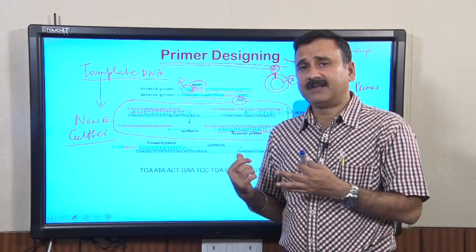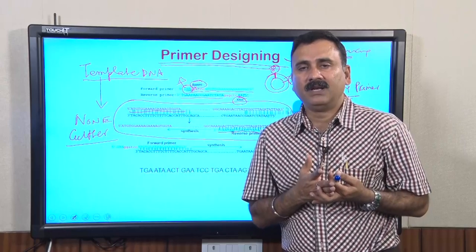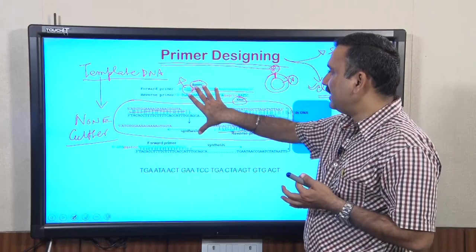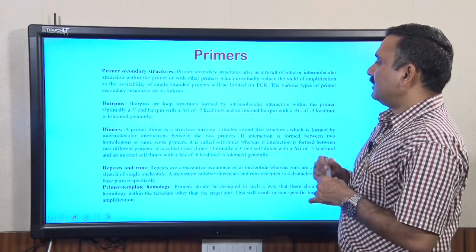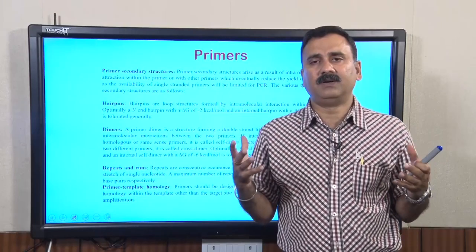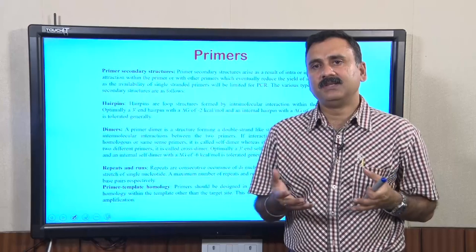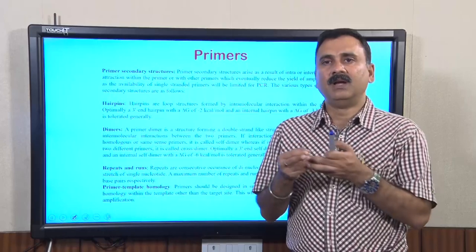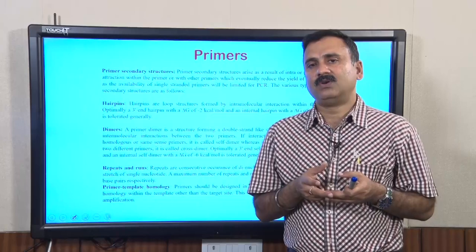We have discussed in the past what quality parameters we should have. We should have the TM, we should have annealing temperatures, all those kinds of things. So, let us see how you are going to analyze this in the analysis part and what problems you are going to encounter. For the analysis we have a couple of softwares which you can use to analyze these sequences to calculate different parameters, for example the TM, annealing temperatures, GC clamps, and looking for all other kinds of problems.